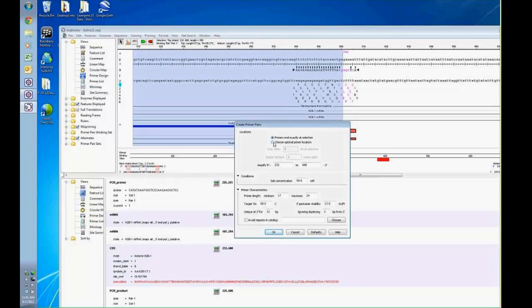If you want to stay within a certain number of base pairs of selection, display at most, in this specific case, when I select the primer to stand exactly at that position, it's only going to give me one primer combination to choose. The primers that are created are based on the nearest neighbor method. Based on that method, these are the primers that they would recommend.